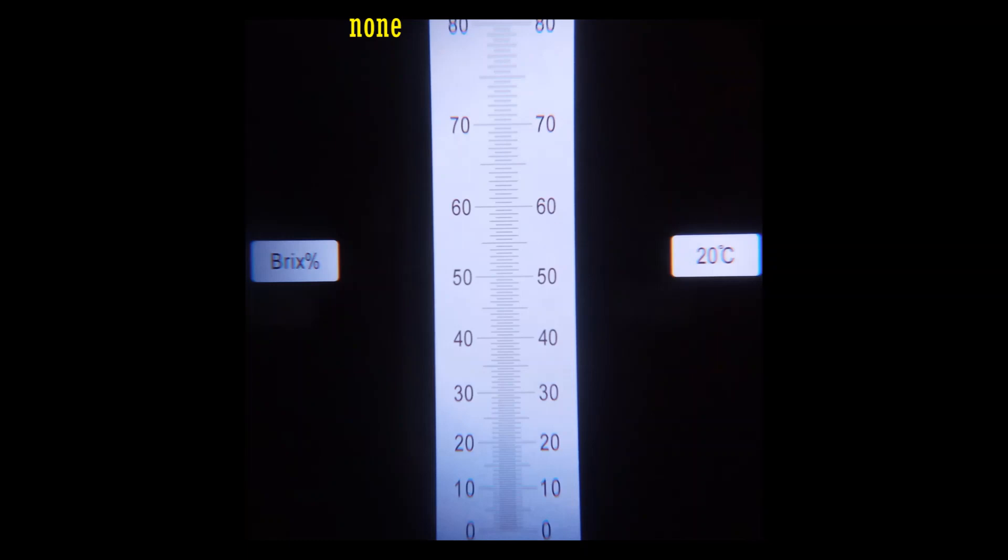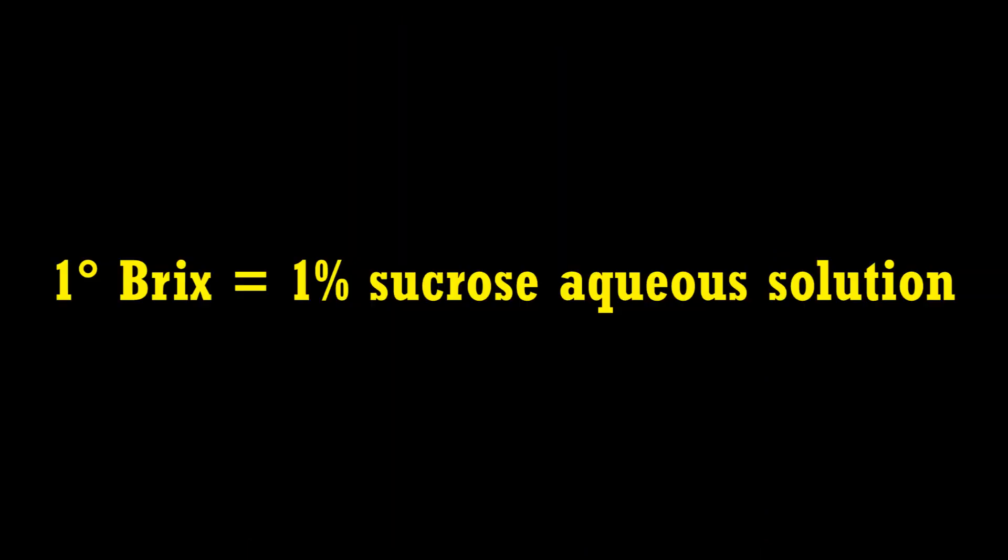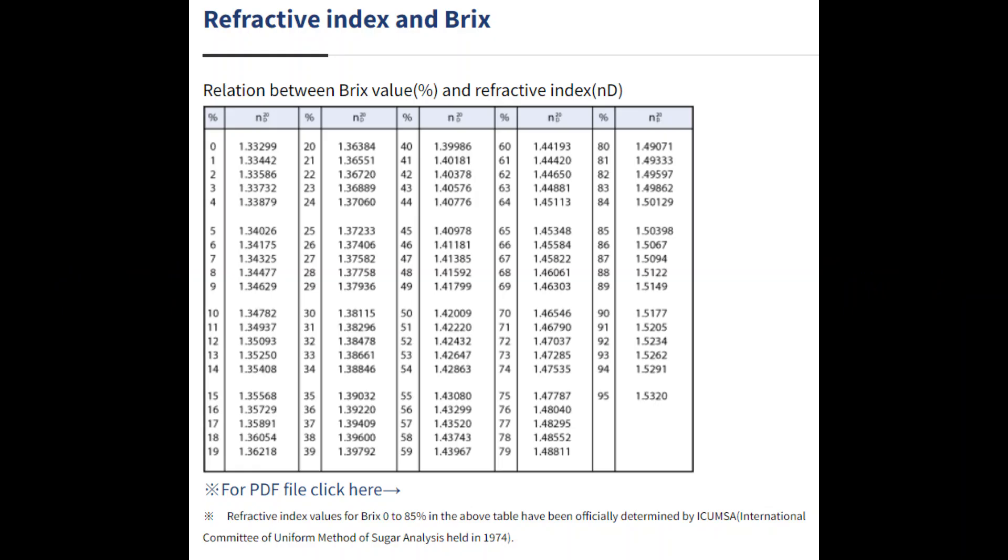If no sample is applied, what we see is the following. A scale from 0 to 80 BRIX grade. One BRIX grade correspond to 1% aqueous sucrose solution. Conversion of BRIX scale to refractive index can be found from Atago website.